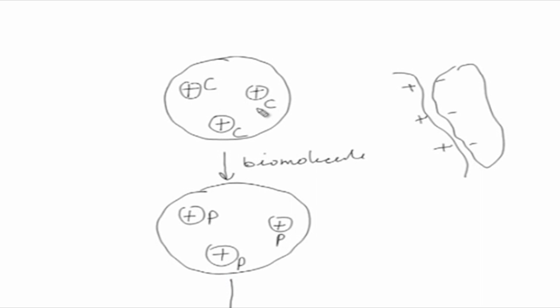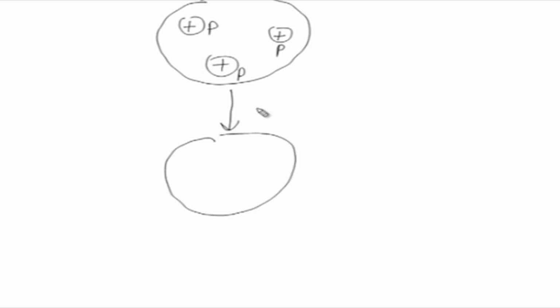So, next step would be elution. This was binding, and the next step is elution, where you have eluted with say NaCl or some other eluent. So, what will happen? This positive charge will now be replaced by say chloride ion, and you will get protein which is eluted.